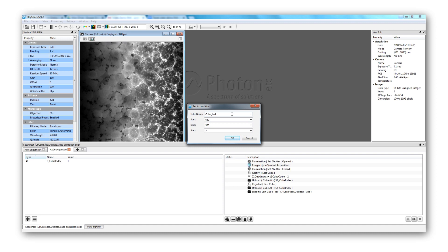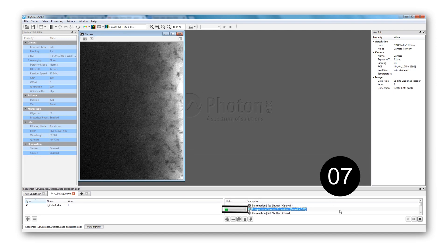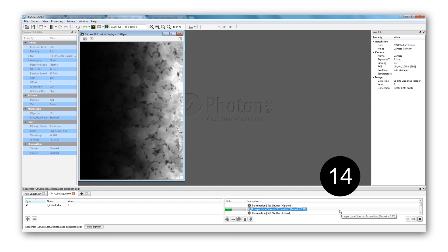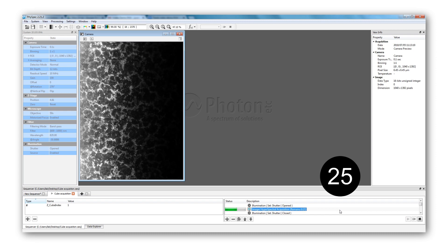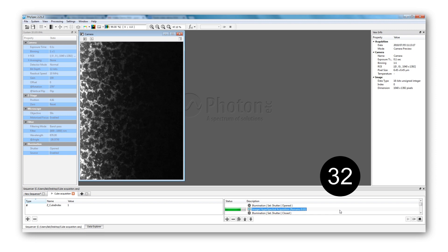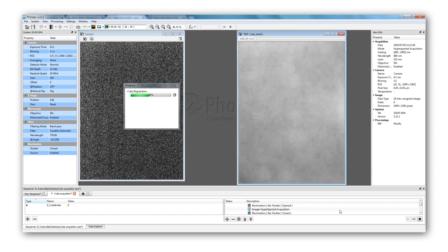Then we add some post-processing manipulations. After making sure the laser shutter is open, we are now ready to start the acquisition. As the system scans through the wavelengths, we can see the stages of the acquisition. An approximation of the time remaining is indicated by the status of the hyperspectral acquisition. The photoluminescence signal is quite strong for perovskite, which is why the exposure time per image is as small as 0.1 second, and we can stay at a really low power density of around 10 suns. The acquisition took around 40 seconds, and now the post-processing is being applied.